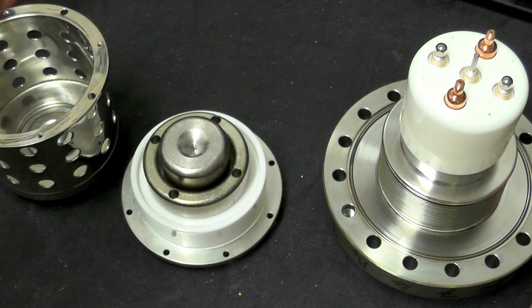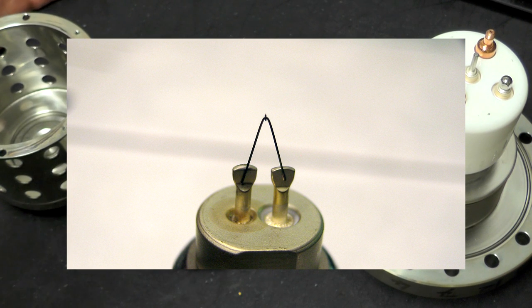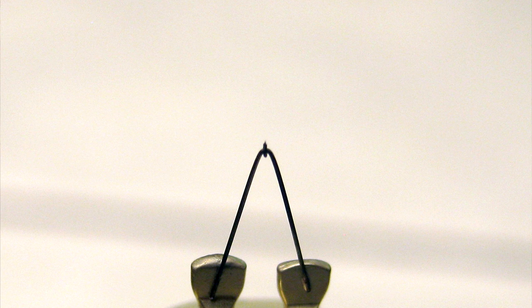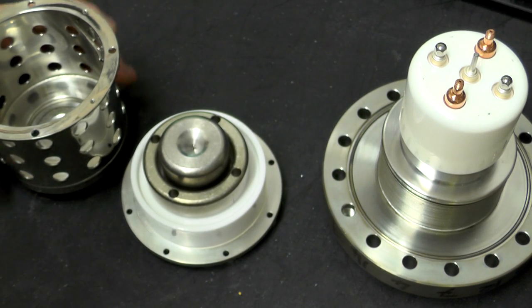So how does all this work? The filament is a V shape with a small piece of tungsten attached to the end. The tungsten is shaped conically and comes down to an extremely fine point — I believe in the order of about 100 nanometers. To pull a stream of electrons off this, you bias the Wehnelt cap to two or three thousand volts in relation to the actual filament.